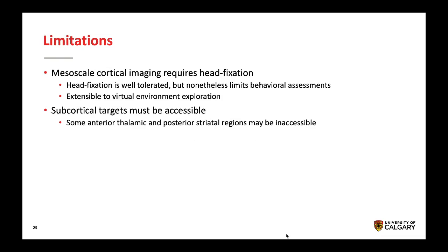There are some limitations, the first of which is that mesoscale cortical imaging for the most part requires head fixation. While head fixation is well tolerated, it limits the scope of behavioral assessments that are possible.